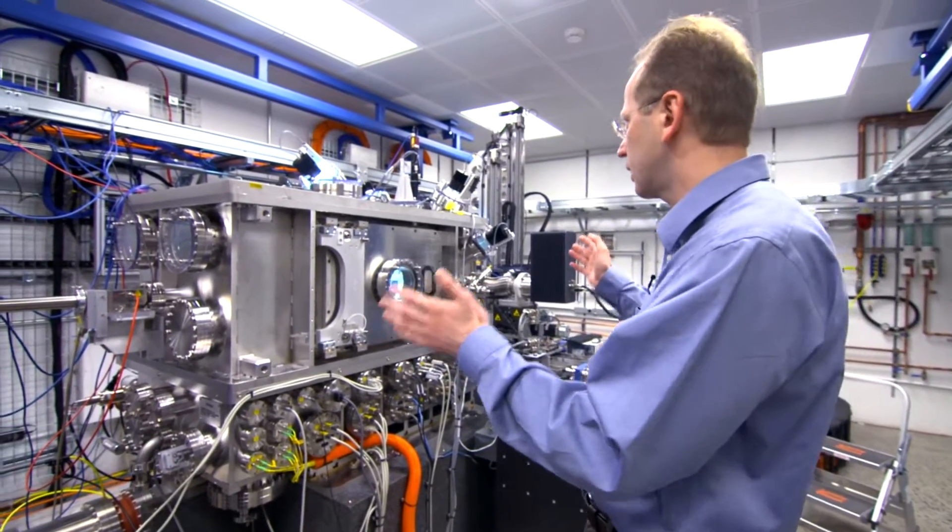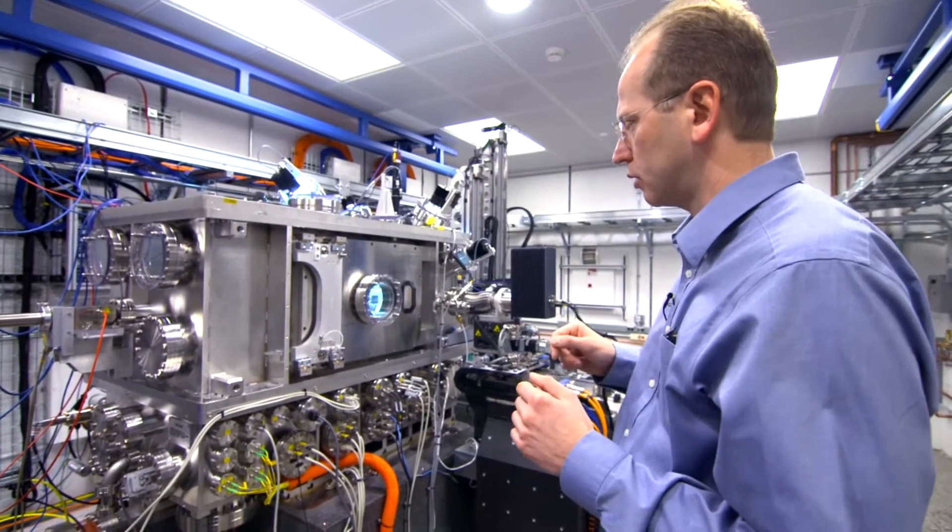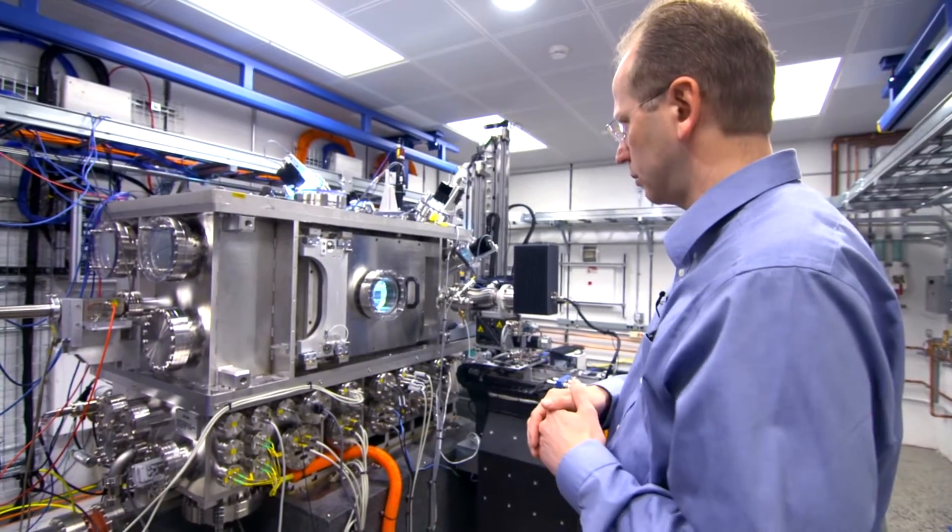And as you can see here, that's the vacuum chamber which hosts the microscope, and it resides on top of the granite block to minimize vibrations.